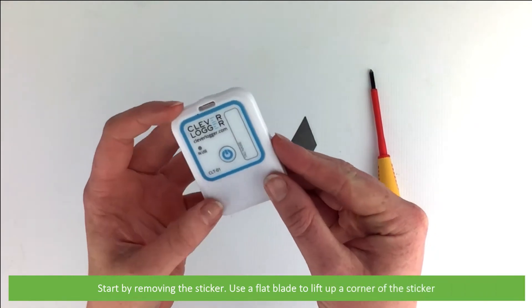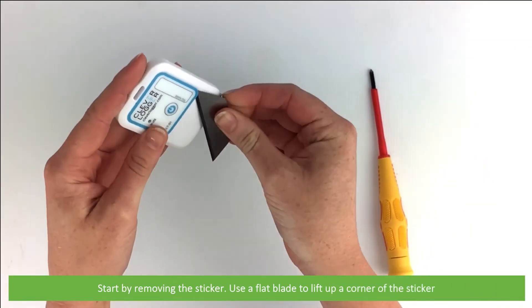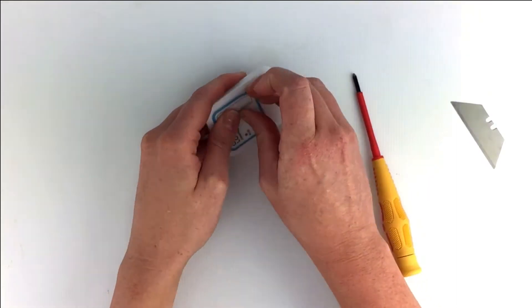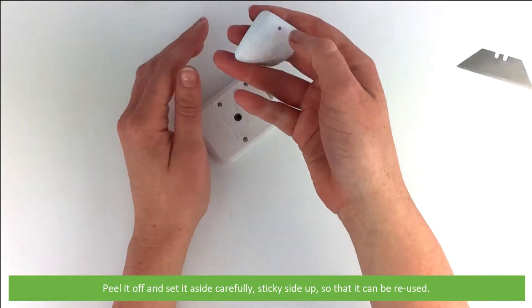Start by removing the sticker. Use the flat blade to lift up a corner of the sticker. Peel it off and set it aside carefully, sticky side up so it can be reused.